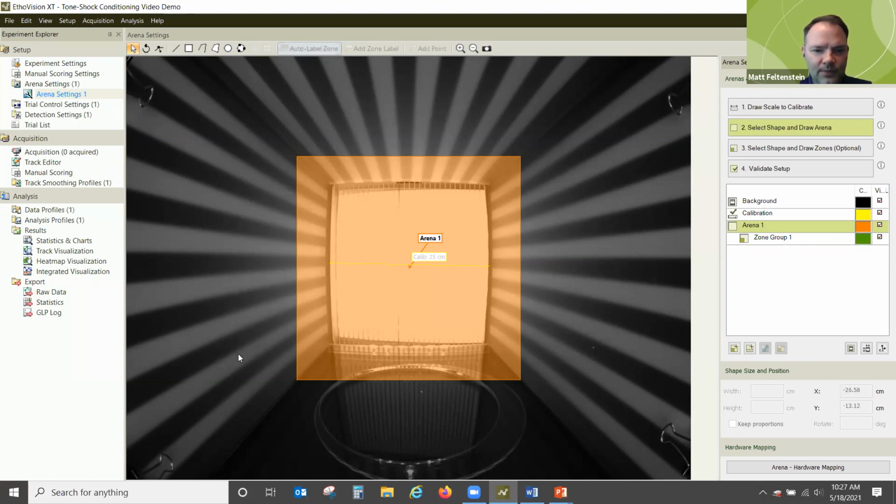I believe this is a contextual and cue study, so he put the white stripes in here. Ugo Basile provides solid colors, checkerboard patterns, stripes, etc. And you can use these if you would like to use them for a contextual study.